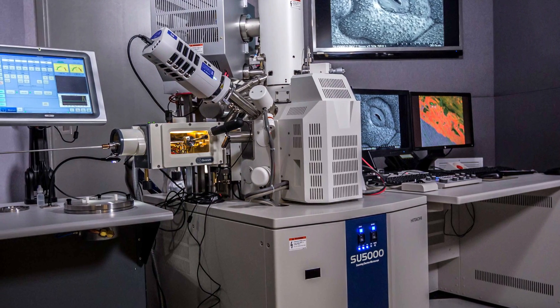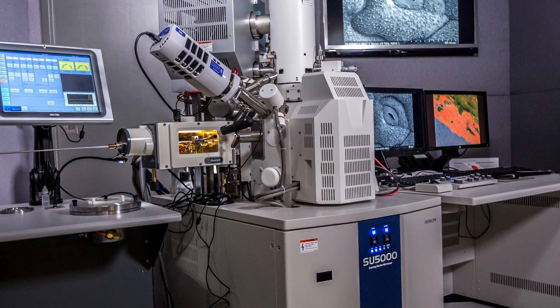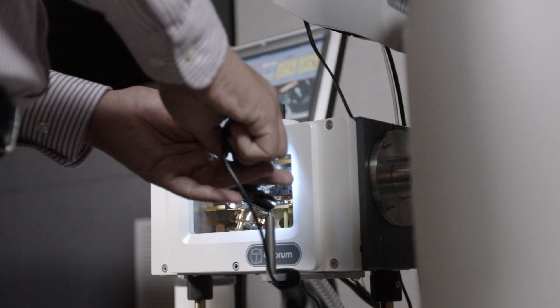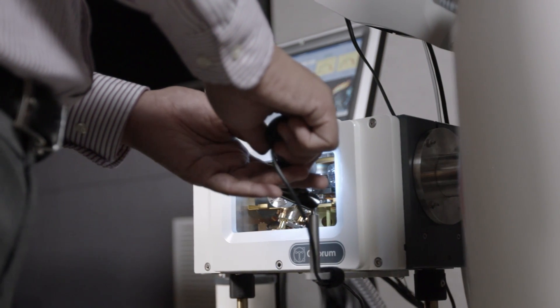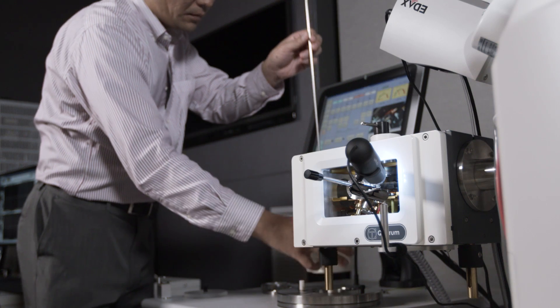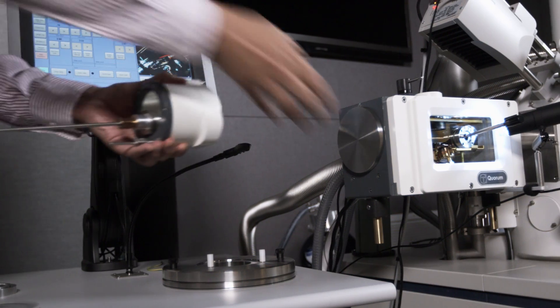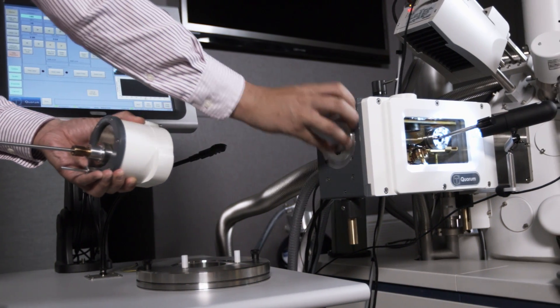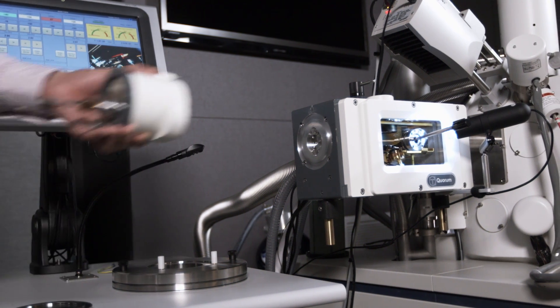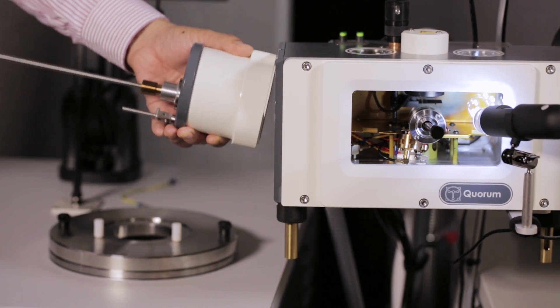The Quorum automated, easy-to-use column-mounted gas-cooled cryopreparation system and Hitachi electron microscopes employ an integrated interlock system that automatically recognizes the cryo setup and prevents any interference with stage movement. The Quorum PP3010T cryopreparation instrument is the latest in cryo-EM technology systems.